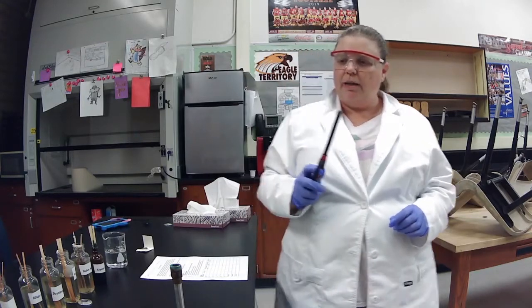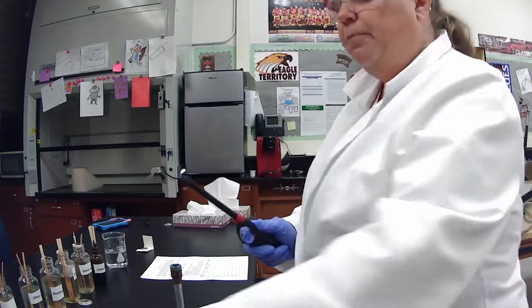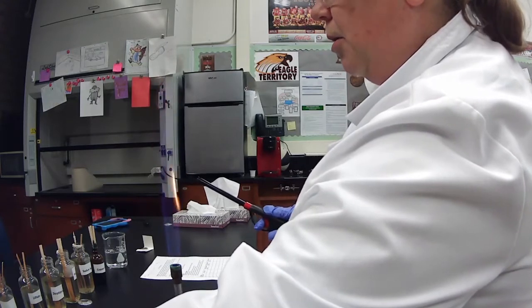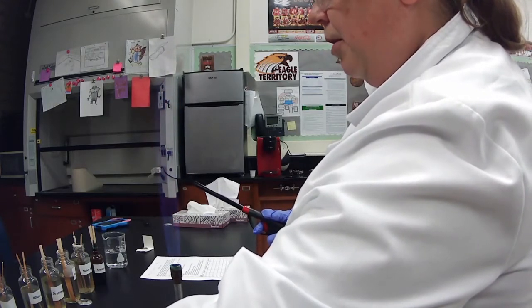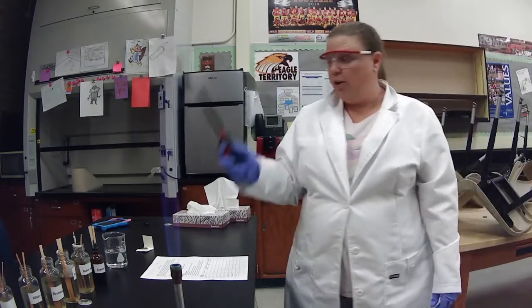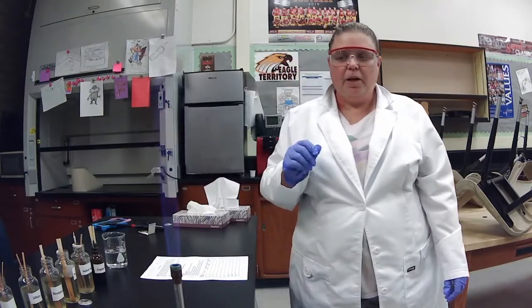So let's go ahead and get our Bunsen burner started. I'm going to go ahead and start my flame. I'm going to turn on my gas, and there we go. So we have our Bunsen burner on. We're going to take our lighter and place it away from anything, okay?